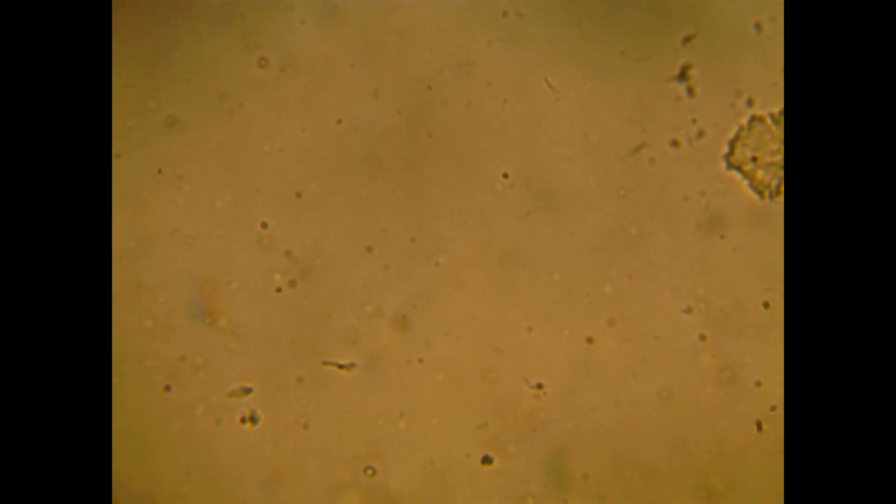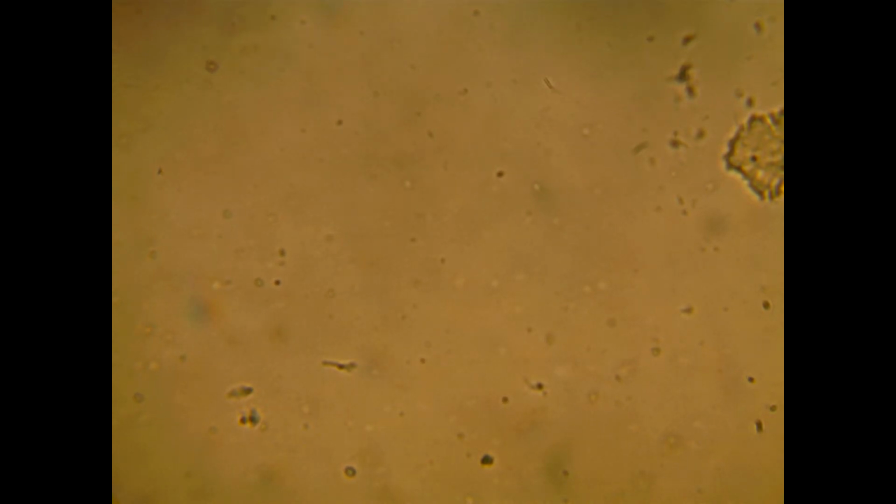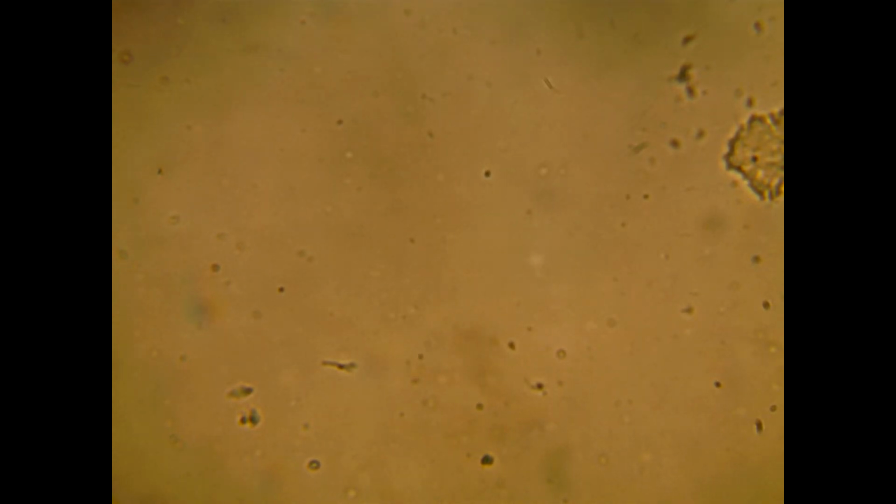See a little bit over there to the left, but you can see some to the right. And what you see over there on the upper right, actually I see some guys moving around up there too. But those are just little particles, maybe little pieces of mineral or something like that that's actually in that compost. Now you'll see a few things that are pieces of things that are either on the slide or on the lens, and that's just debris. So it's not part of the sample itself.